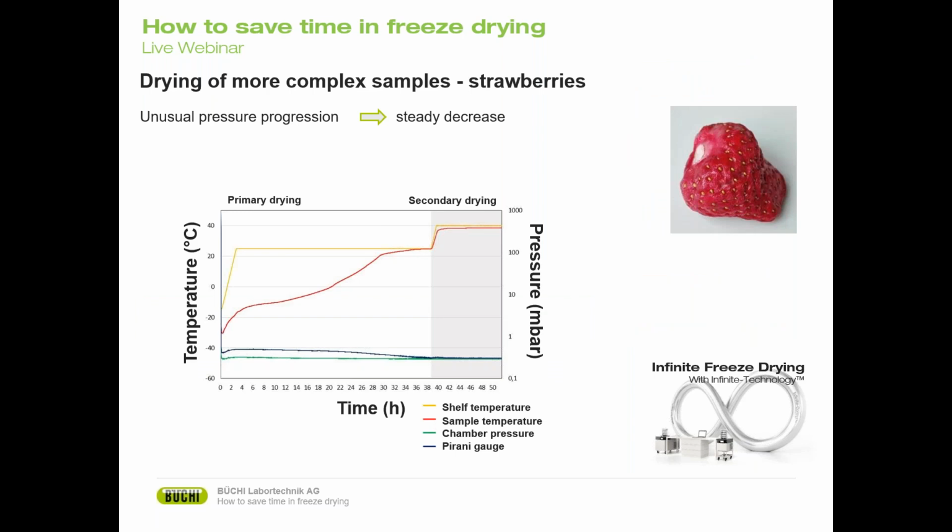Because first of all, they are solid, so temperature control measurement does not necessarily work here. And also they're very heterogeneous because they're different in shape and size. And you can see the result here. As you can see, I still have a temperature curve.